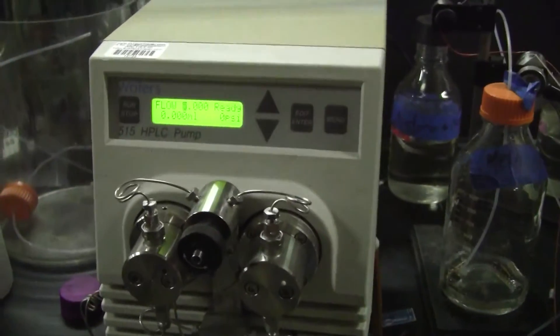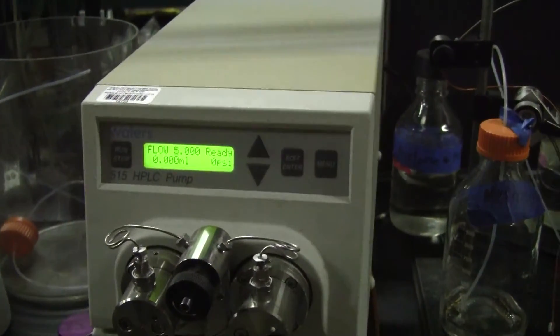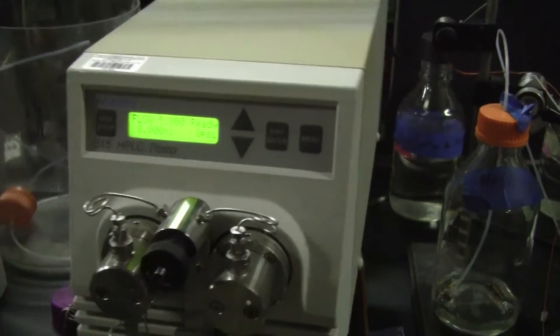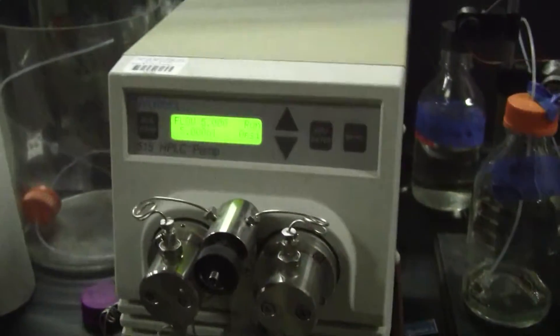We're just doing a little flow test. We have the flow set at 5 milliliters per minute. We're going to hit run. We're going to let that build up pressure because we're using a little bit of a column.